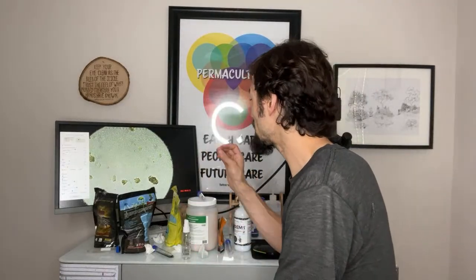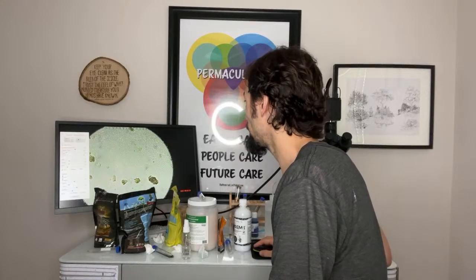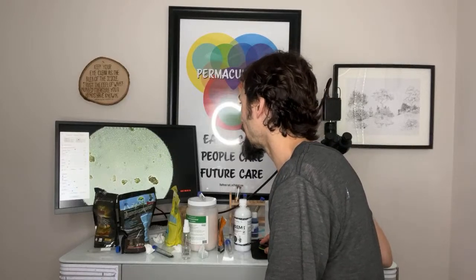And I know I said there's sand in here and clay in here, but it's A, their carrier, and B, it's doing a great job. So just because it's sand and we're like, there's sand everywhere, that's not a bad thing. You know what I mean? One of the primary ways that sand water filters work is they harbor bacteria, very specific bacteria that helps clean the water as it filters through. So this is absolutely teeming with life, and they're so tiny.